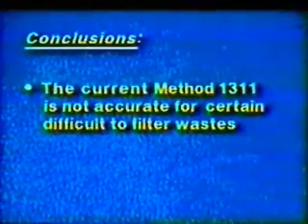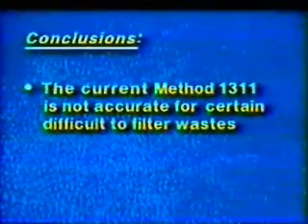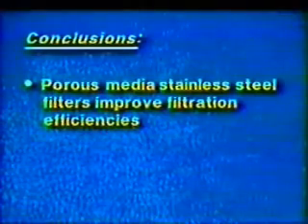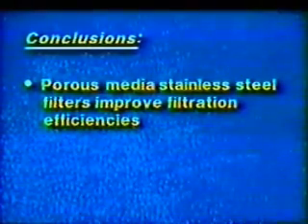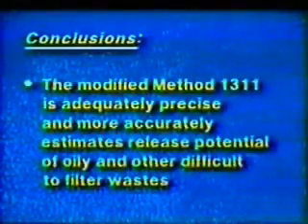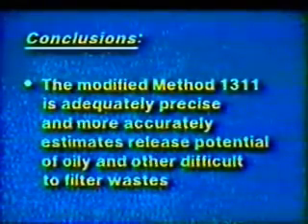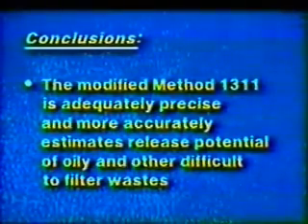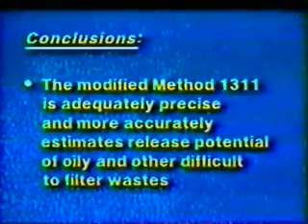To recap, the current method 1311 is not accurate for certain difficult-to-filter wastes. Porous media stainless steel filters improve filtration efficiencies. The modified method 1311 is adequately precise and more accurately estimates release potential of oily and other difficult-to-filter wastes.